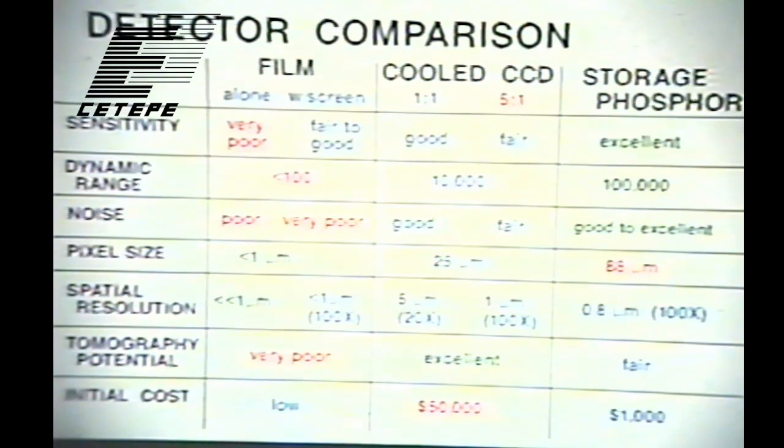And this noise is primarily associated, I mentioned you clock the charge out into a serial register, and then you clock it out in the other direction to an output diode. And this noise is primarily associated with the resetting of that output diode every time you read the charge. There's a thermal and other uncertainty. You try to set the output to 0, but there's this much uncertainty about that 0 level in a cheap chip that's not cooled. And it's taken a lot of technology to get it down to here.